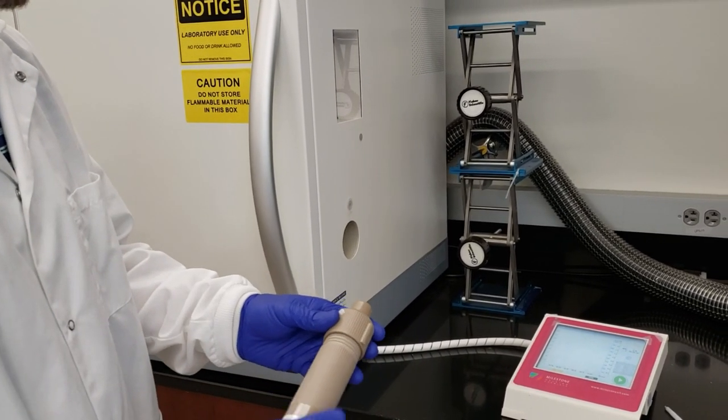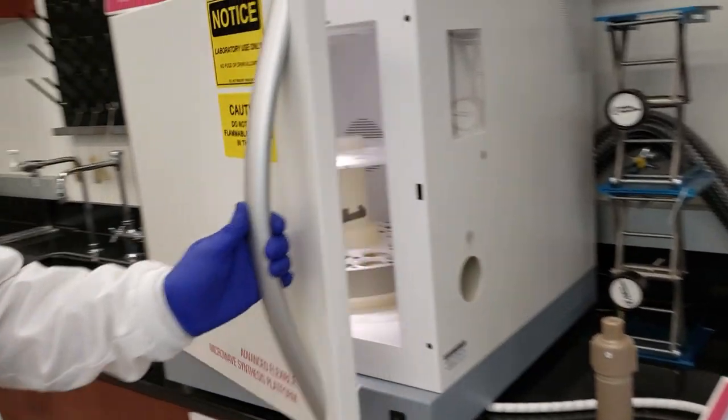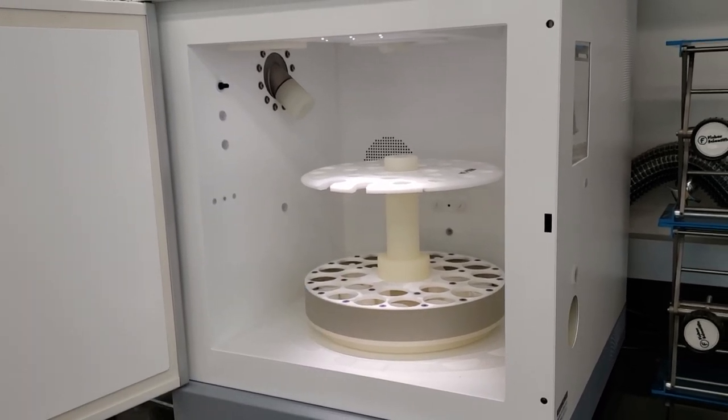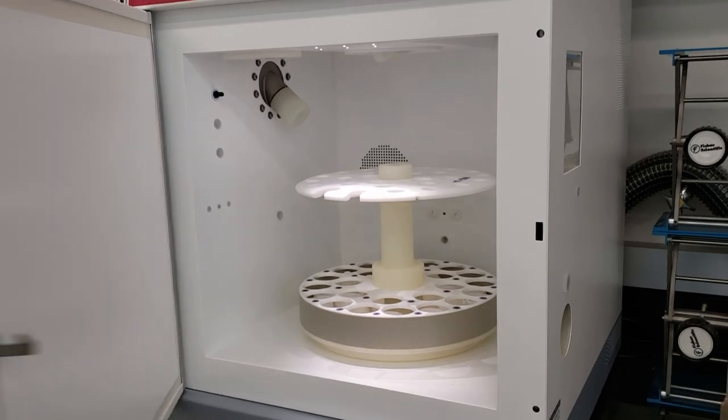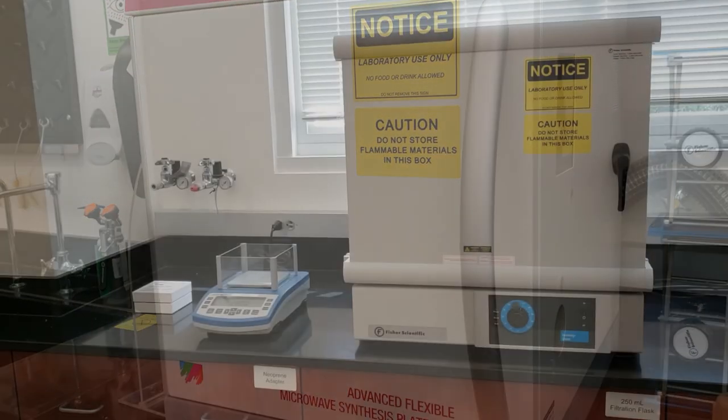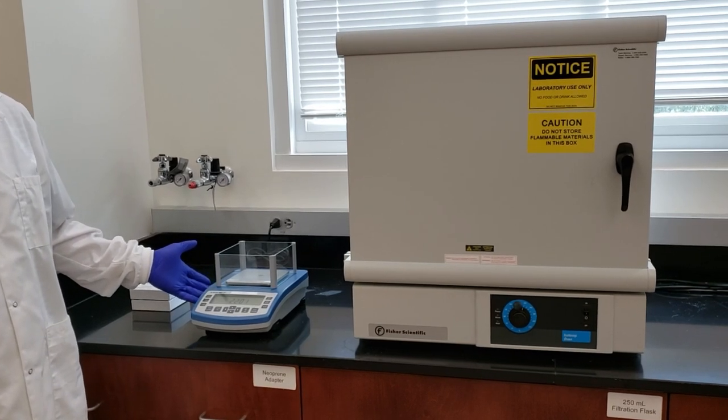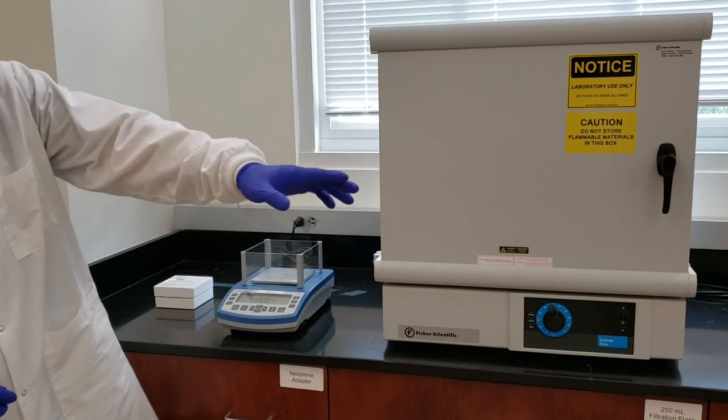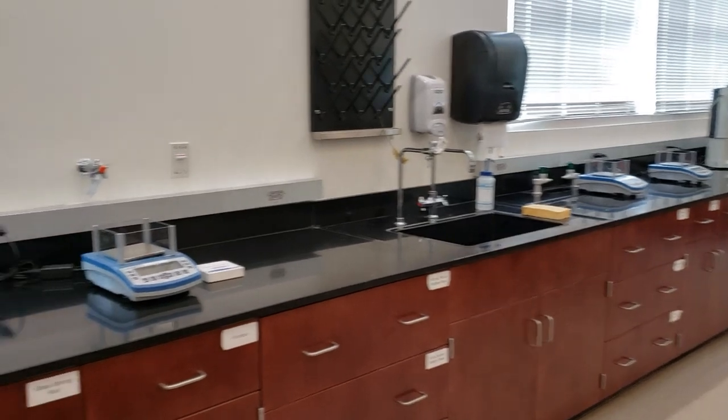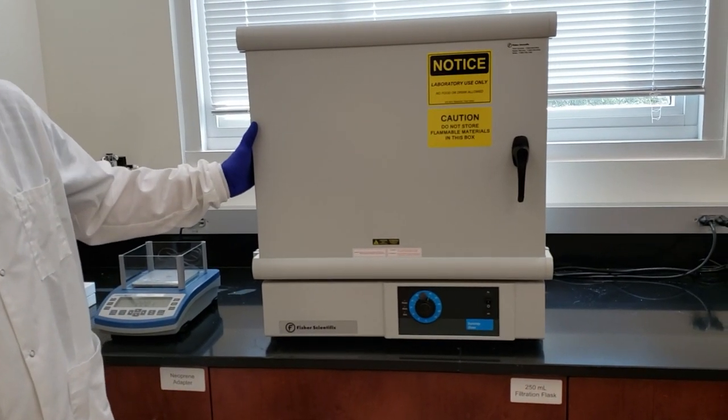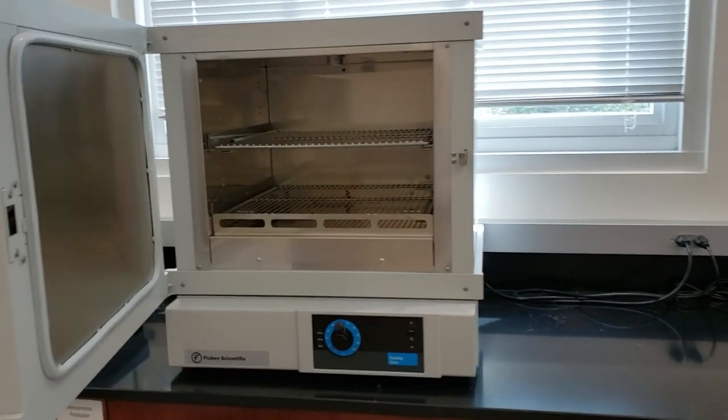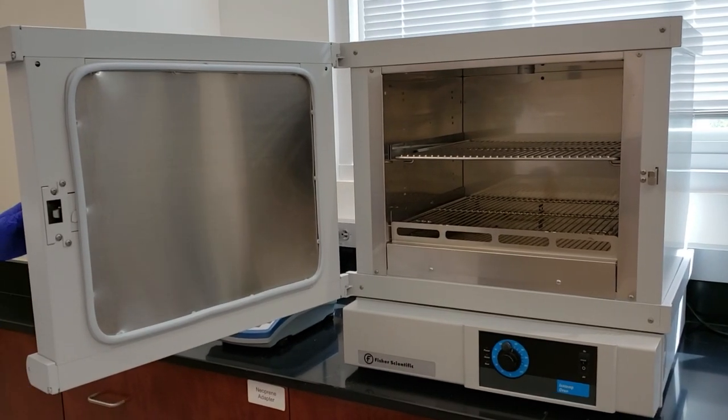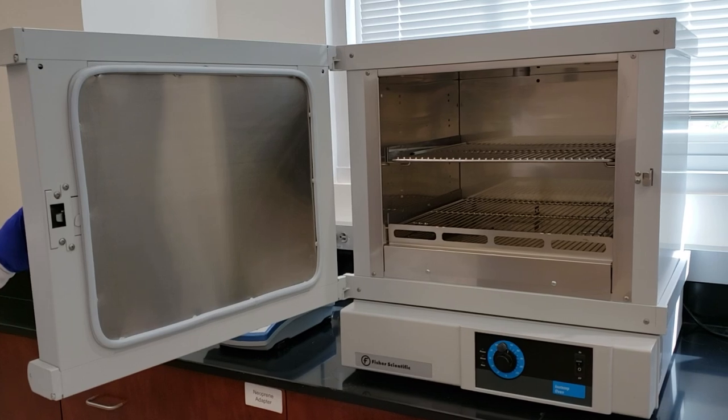Let's look inside. We take our reaction tubes, place them into our carousel, and can do 24 reactions all at the same time in a single unit. In the back of the room we've got four balances to weigh out solids at the beginning and measure product weights at the end, arranged across the back. We also have our drying oven with drying racks inside. You'll often take a damp product on a watch glass and place it inside the drying oven to drive off any remaining water, alcohol solvent, and things of that nature.